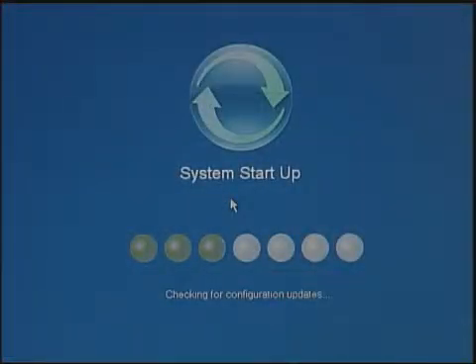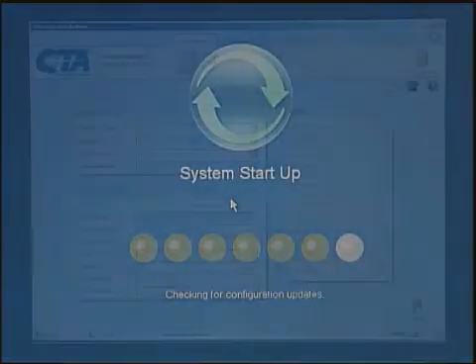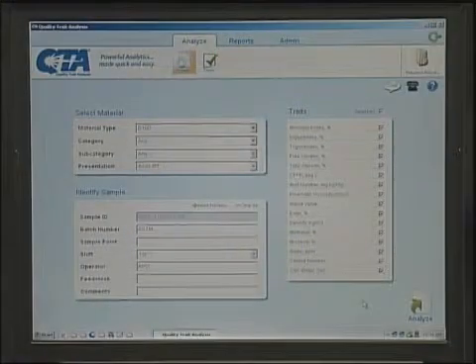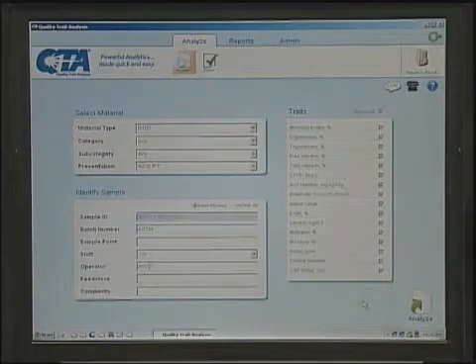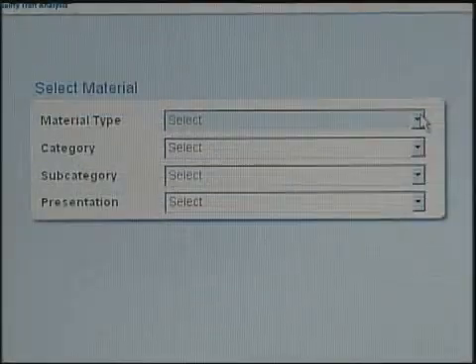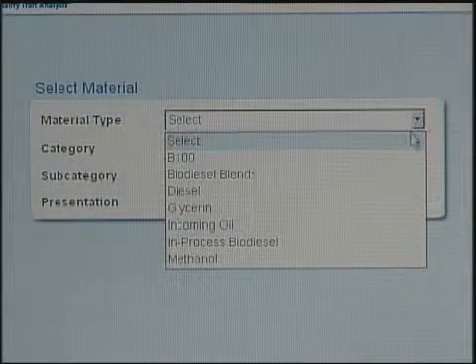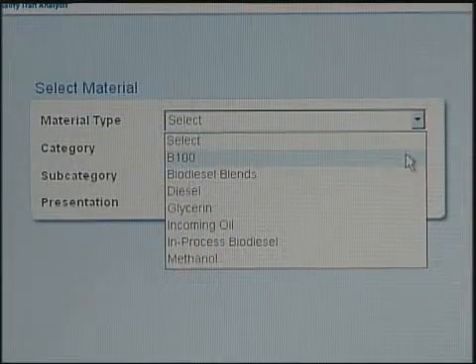The system will check for configuration updates. To run an analysis, select the material type and the category appropriate for the material.